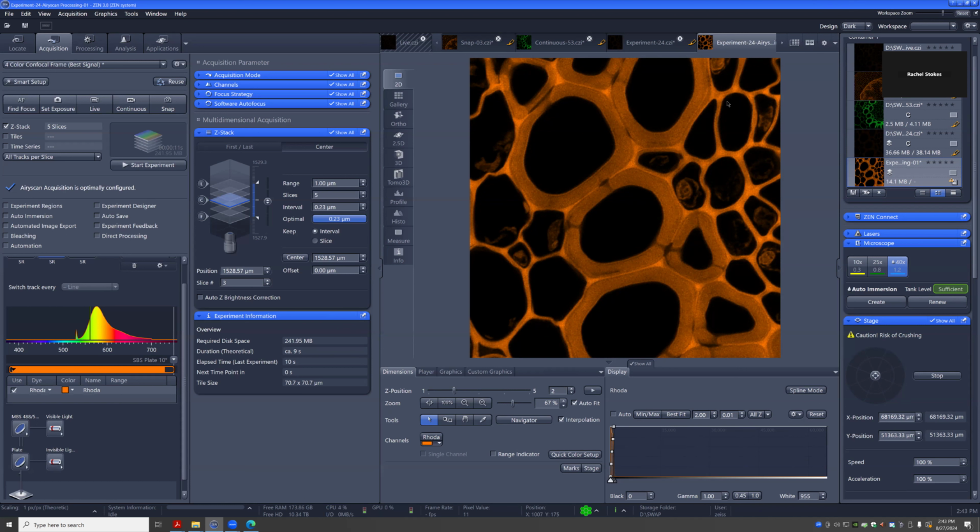I would still keep the raw data too, just to make sure that you can always go back and reprocess it if you need it. But that's really the important difference here. You generate a processed file, and this lets us also get into the direct processing because this is the manual way of doing it, right?